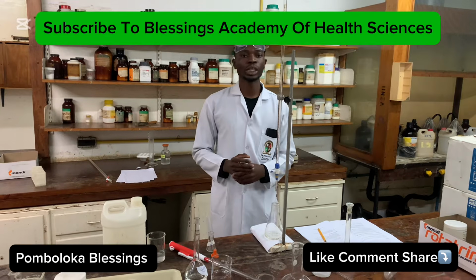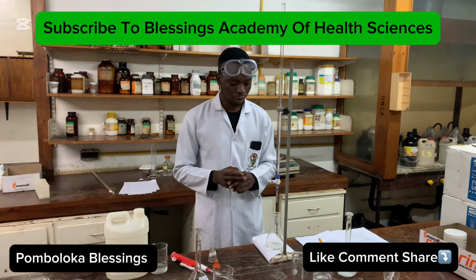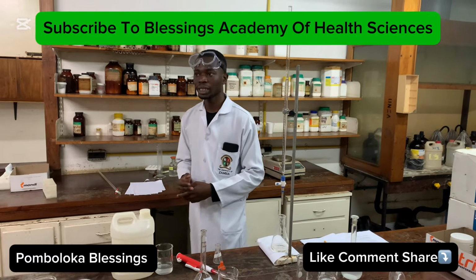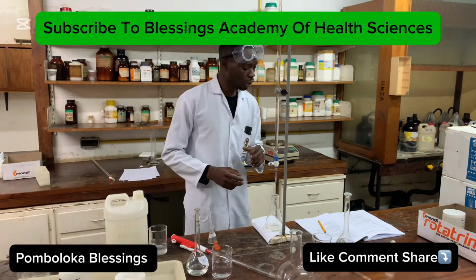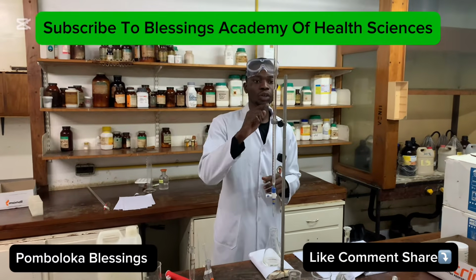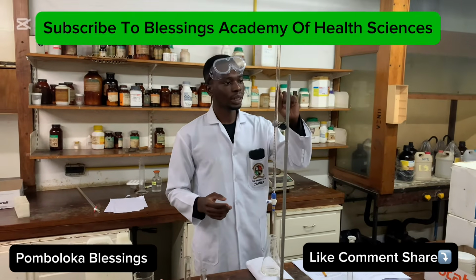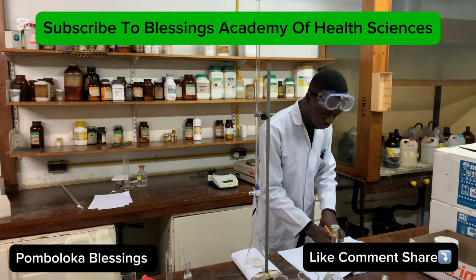And then the next step is to titrate with sodium hydroxide. Remember, what we have in the burette here is the titrant, which is sodium hydroxide. And then we have our mixture here. We added 2 to 3 drops of the phenolphthalein indicator. And now remember, in the first trial, we got a certain volume of the sodium hydroxide from the burette. So we went on to 16.8. Okay, that was the first trial.